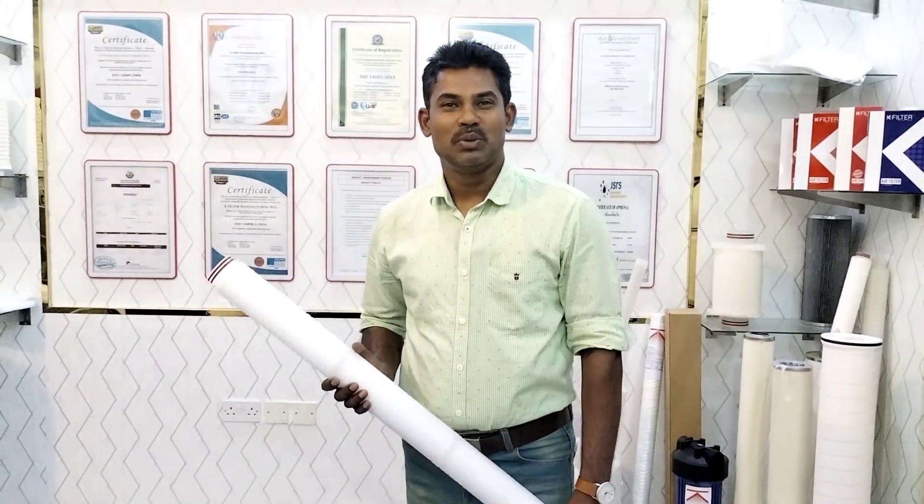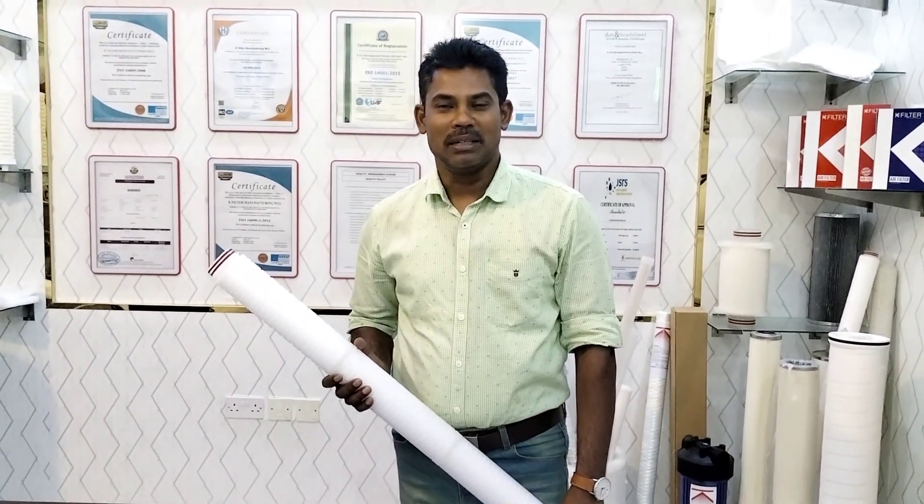Hi, this is Shaiju from K-Filters, Qatar. We are one of the leading process and inter-series filter manufacturers in the Middle East region. Today I am going to introduce you to our K-Pure P series pleated filter cartridges.